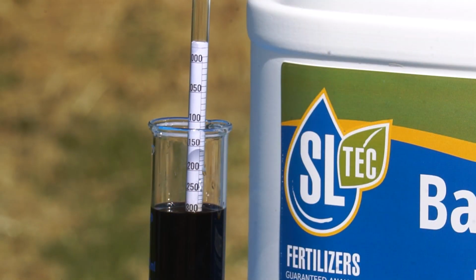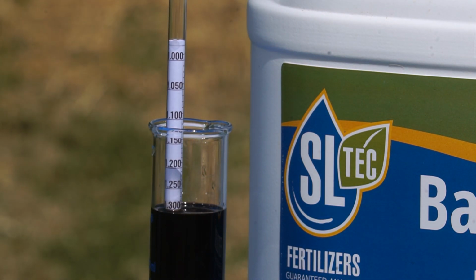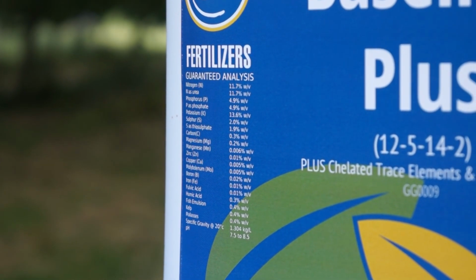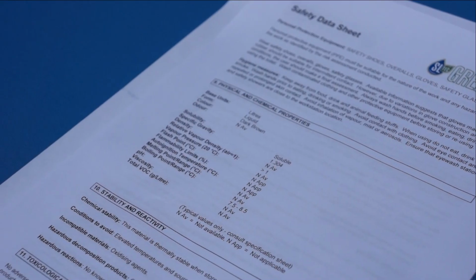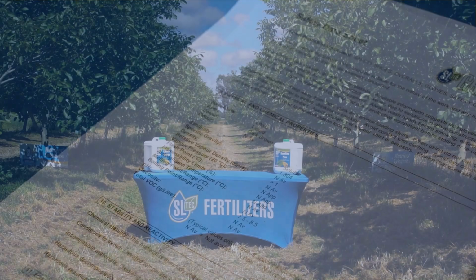When you receive your fertiliser on farm, taking a quick SG reading can quickly reassure you that the product has been manufactured properly and quickly address any issues should they arise. Check the label for the SG. If it's not listed on the label, check the safety data sheet under Section 9, Physical and Chemical Properties.